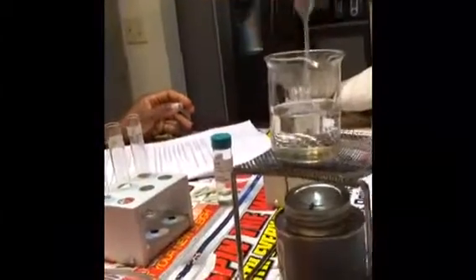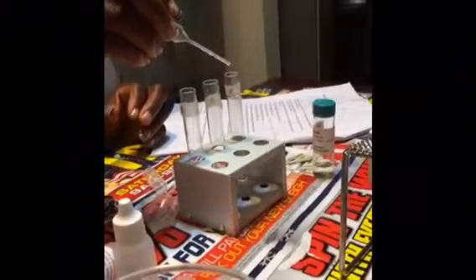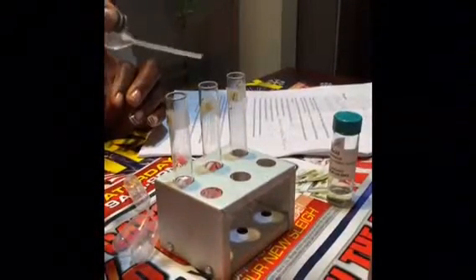All right, now I'm gonna add 20 drops of water into each test tube. Ooh, the tube expanded, so it will pour. 1, 2, 3, up to 20. That seemed like a lot because the tube is expanding.